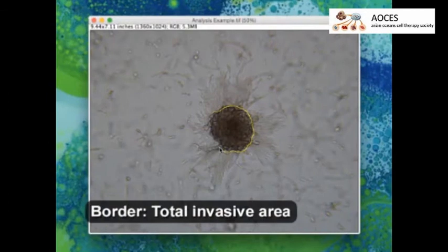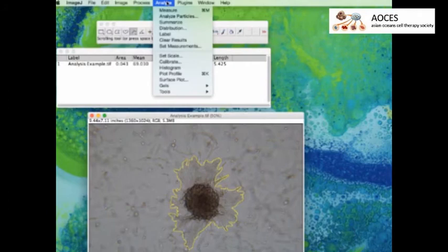To determine the invasive area of the spheroid, use the Freehand Draw tool to trace the border of the spheroid and then the area of invasive cells. Again, click Analyze in the top menu, followed by Measure to display the area measurement.